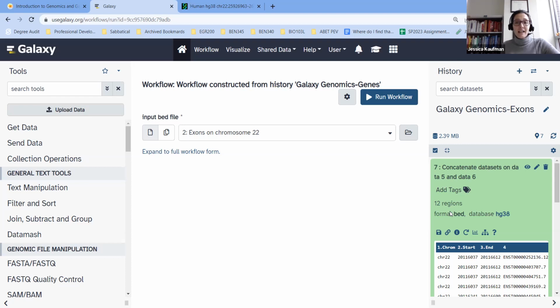If you have anything in this tutorial that you need help with, please email me. Otherwise, I think this is a great start to help you get used to Galaxy with selecting your tools, running your tools, and viewing the results of your tools.